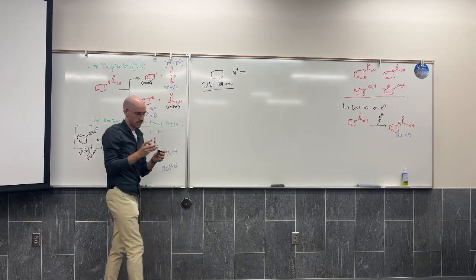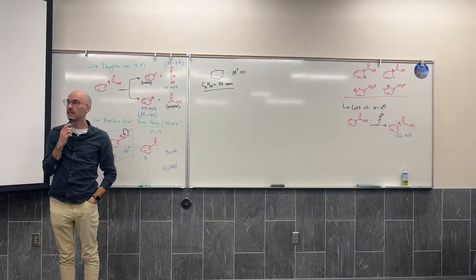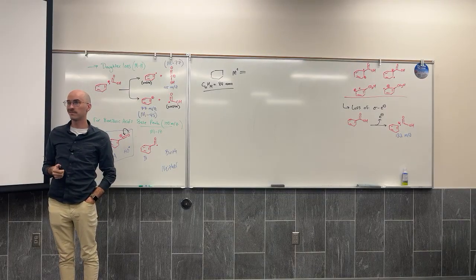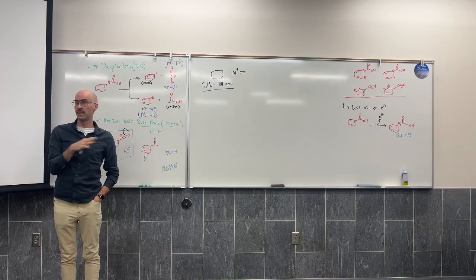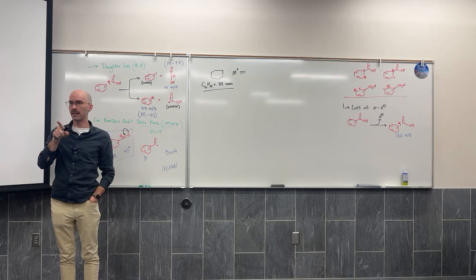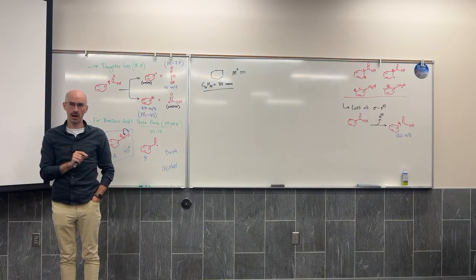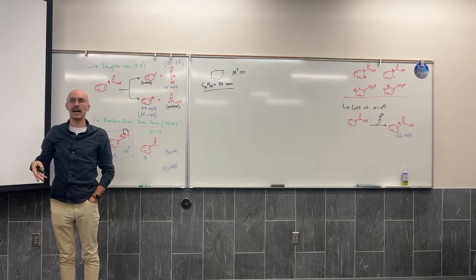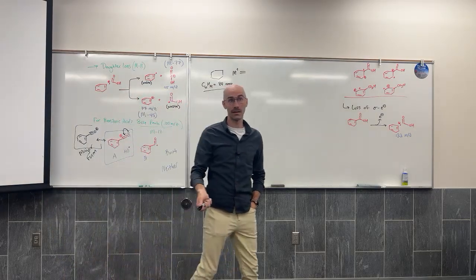Is it always the furthest? I wish. Because sometimes the molecular ion isn't very stable and doesn't last long enough to hit the detector. So in theory, the molecular ion is the heaviest mass ion, the heaviest mass signal. But sometimes it doesn't really show up. So you can't just look at a spectrum and identify it, because it might not be there.